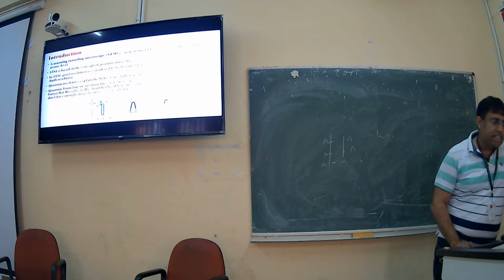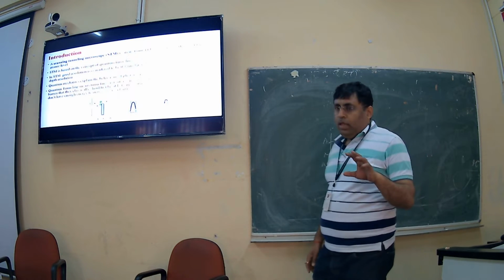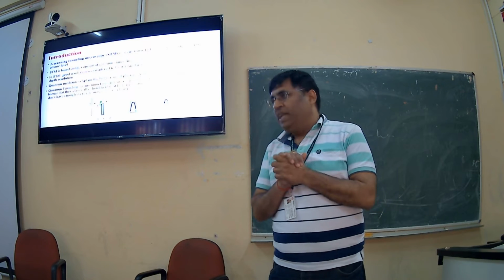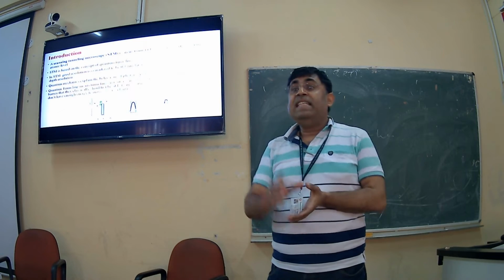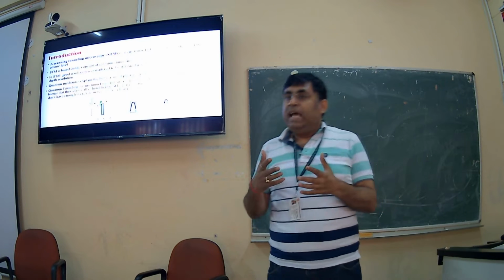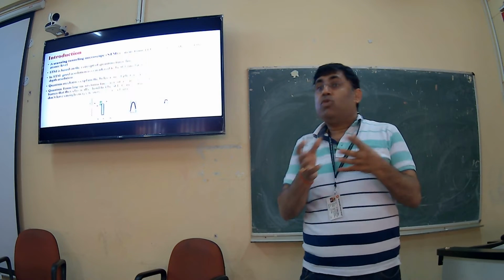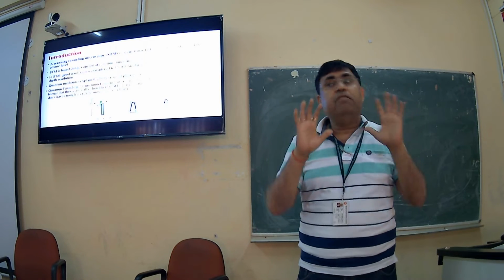Now we will move on to the scanning tunneling microscope. If you want to cross a hill, electron, when it shows the quantum phenomenon, behaves differently. Electron has a dual nature. One is a particle nature, where it acts like a particle, and another is its wave nature. Because it is a wave, it shows quantum phenomena. Let's understand the quantum phenomena.